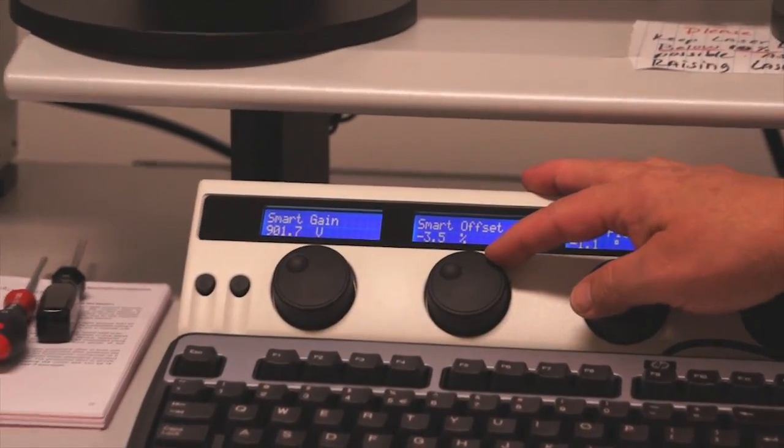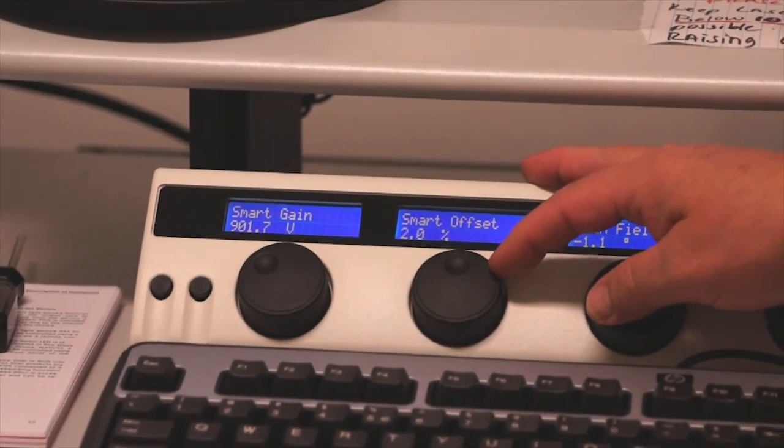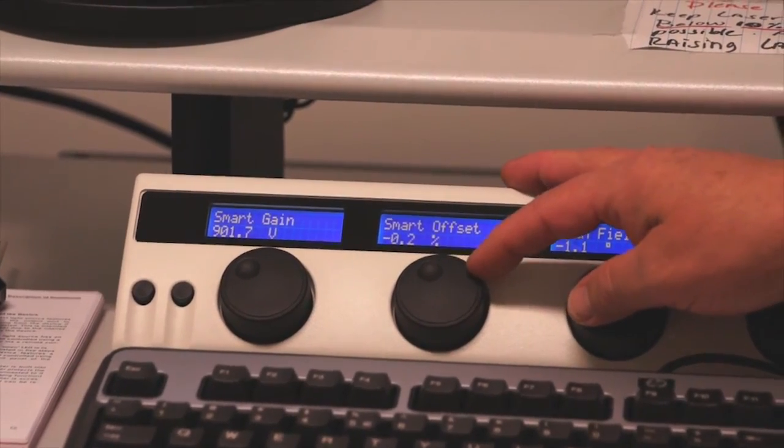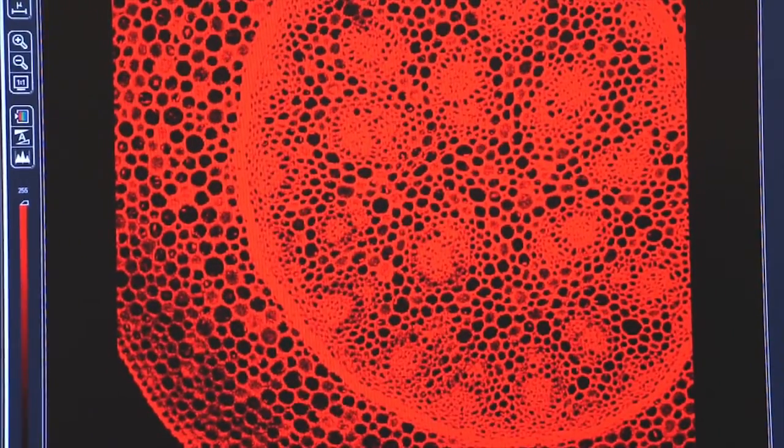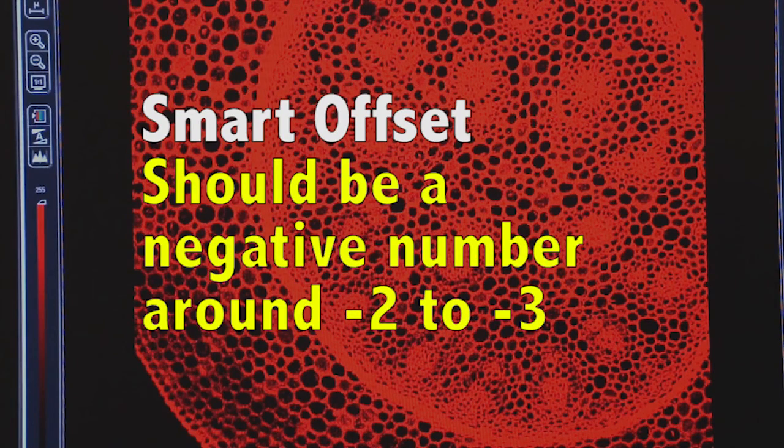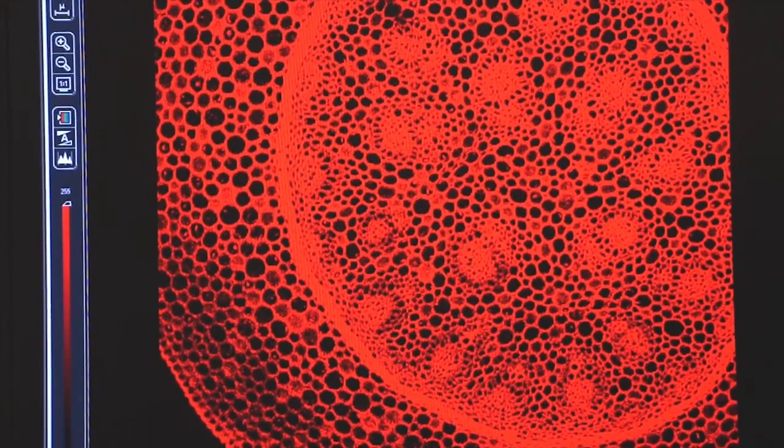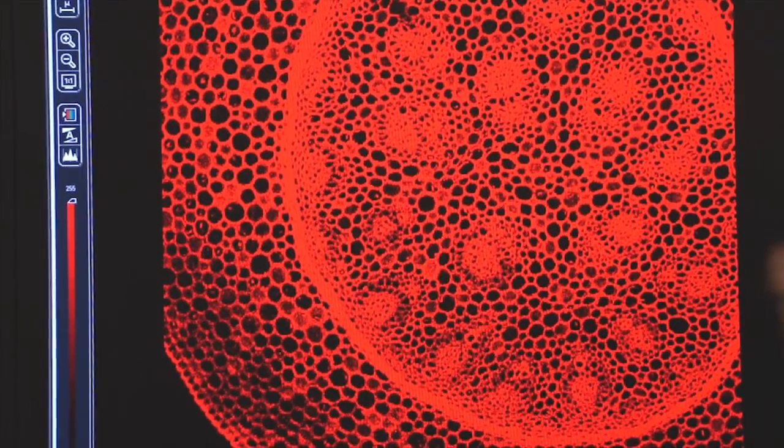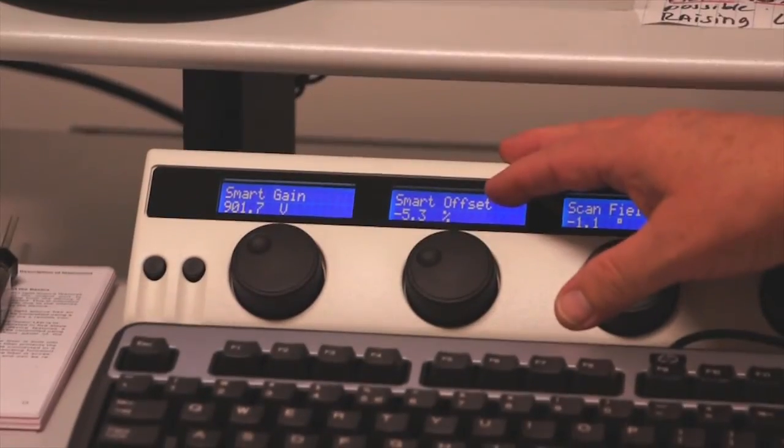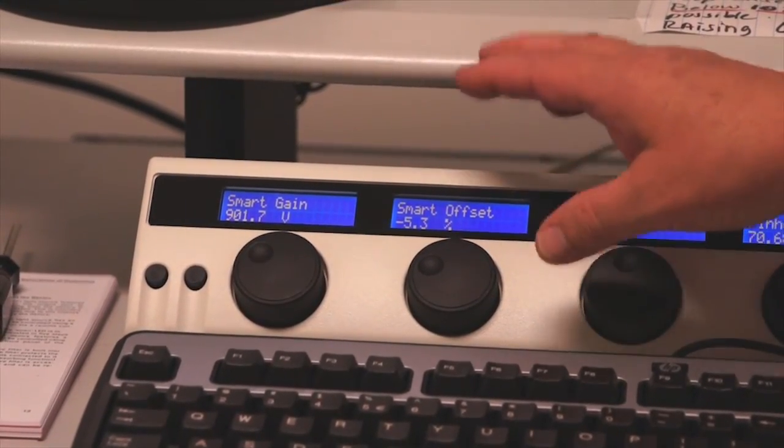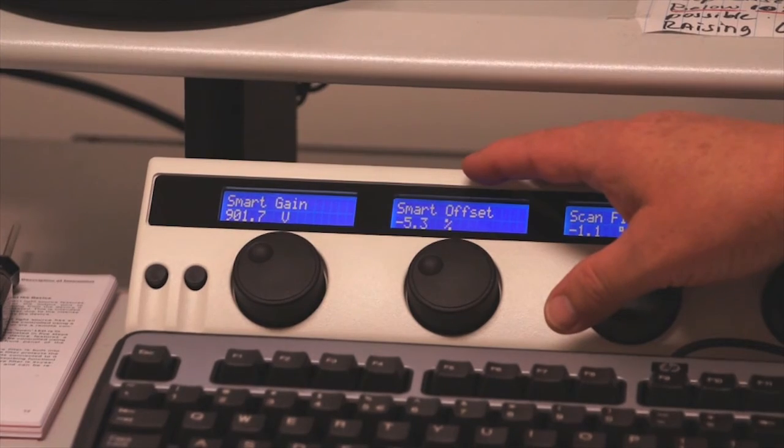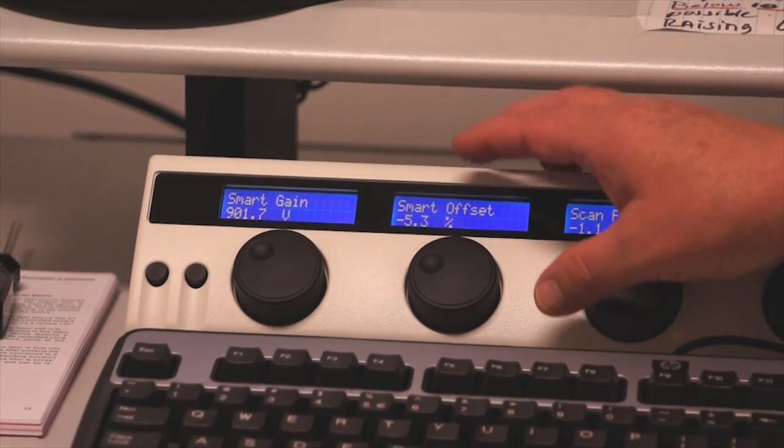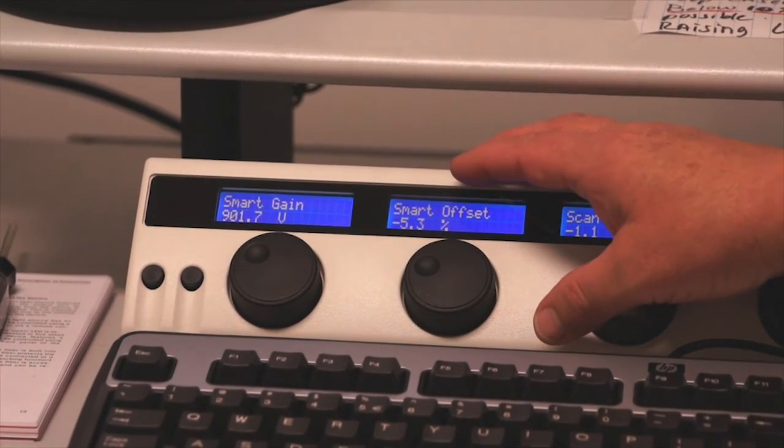The other tool that's important on the toolbar in getting a good image is the smart offset. The offset should always be a negative number, usually minus 2, minus 3, somewhere in that range. What we're essentially doing is we're controlling the sensitivity of the photomultiplier tube with these two controls. The photomultiplier tube is recording and counting photons that are coming off the image.